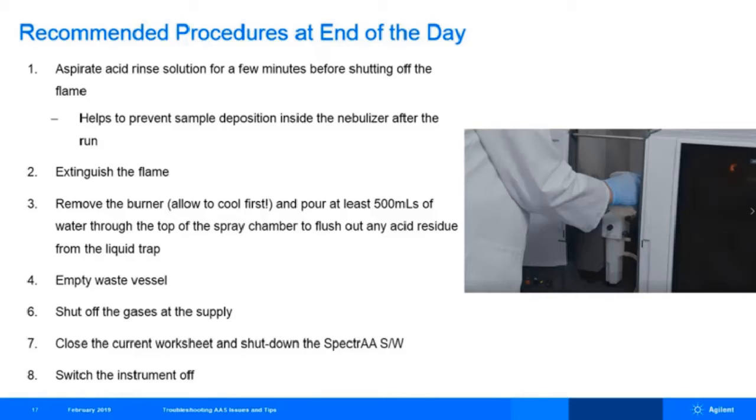We should also think about the procedures that we go through at the end of the day once your analysis is complete, because that also has a big impact on how the instrument performs and especially about how you look after the instrument. So I guess these are really the recommended shutdown procedures. As we said earlier, it's important that we aspirate rinse solution for a few minutes before we shut off the flame, just to wash out the nebulizer and remove any remaining sample residue from the nebulizer. We can then extinguish the flame and allow the burner to cool.